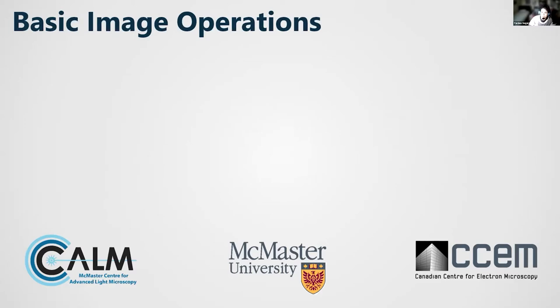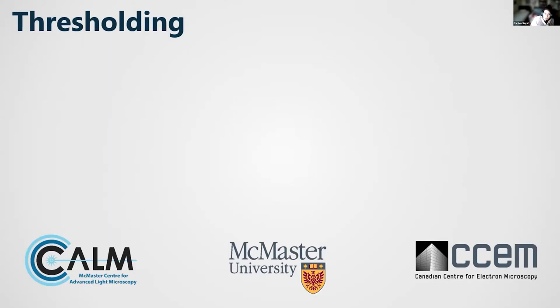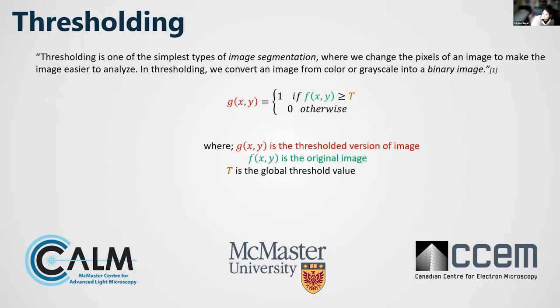What we'll be going over in today's quick summary is basic image operations. We'll be looking at thresholding, some logical operations, as well as convolution and filtering. So what is thresholding? Thresholding is one of the simplest forms of image segmentation, which, as the name suggests, is a process in which we segment the image into different segments. So we're looking at different parts of the image.